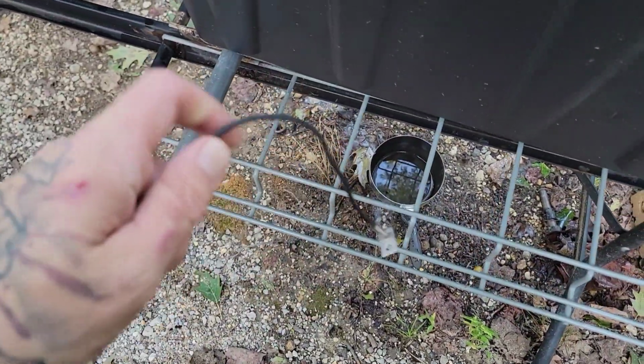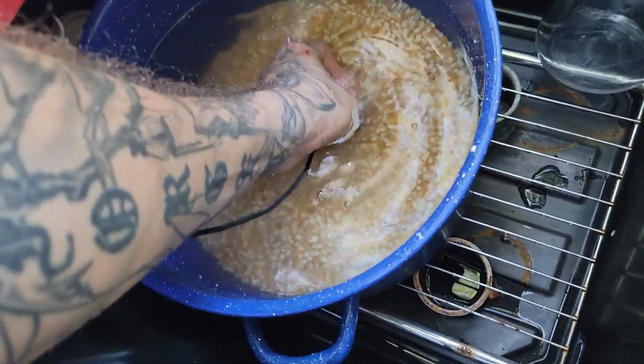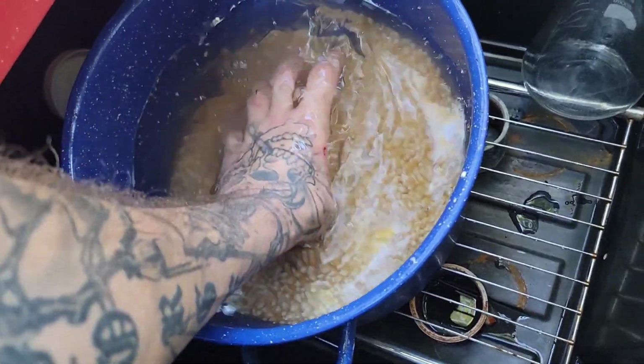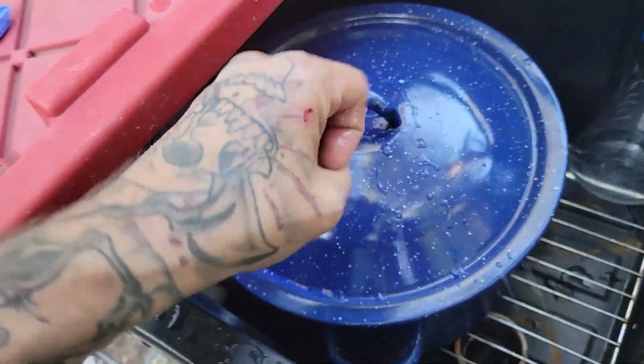Now we take our PID, I think that's what it's called. Sit that in the bottom of the grain, not on the bottom of the pot. If we put it on the bottom of the pot, that'll read falsely. So there we go. Leave it like that. Come back here.